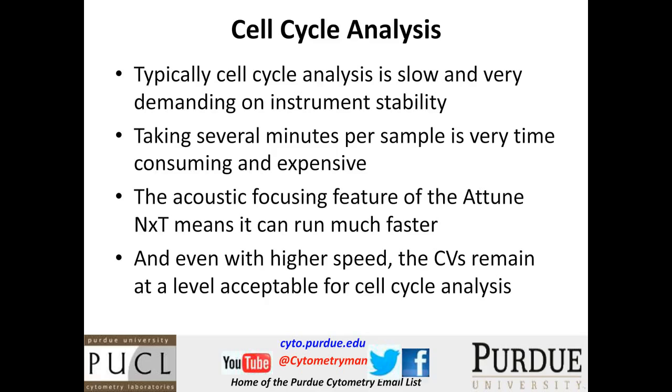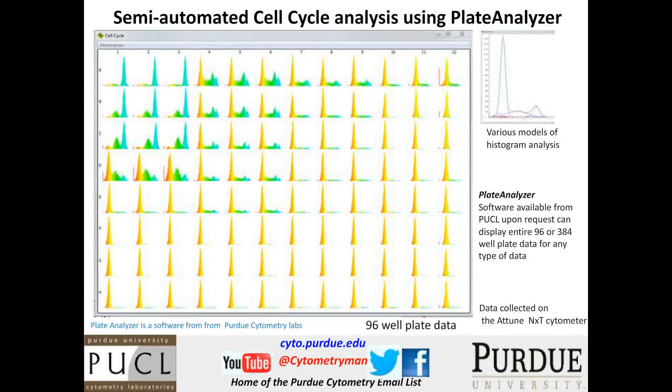And if you do this on a plate, and this is something that I never thought I would see, but if you run an entire plate of cell cycle, well, there's several things that happen. First of all, the analysis is a cinch. One of the things that I've learned over the last several years of running lots of plates is that software is not well defined to look at plates. Why, I don't know, because it's a perfect opportunity. You know where everything is. Plate formats are fixed. You've got 96 well, you have 384 well, etc.